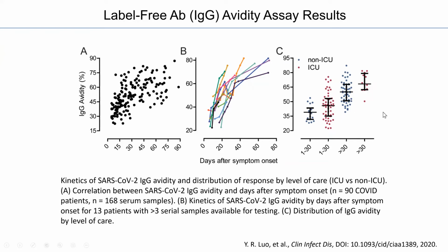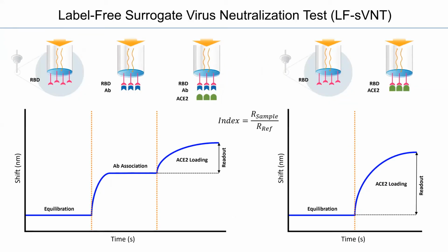So the overall conclusion is that we know IgG avidity increases over time and then stays at a higher level. And we're talking about the time window of about 3 months, which is particularly meaningful because in early COVID-19 publications, usually people measure the serology within 1 or 2 months. And now we extended to a longer time, and it helps to monitor the serology parameters over a longer period of time. So far, I have introduced how we measured the antibody concentrations and avidity in patient serum.